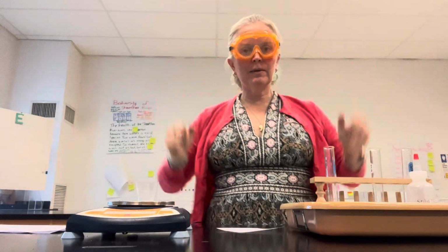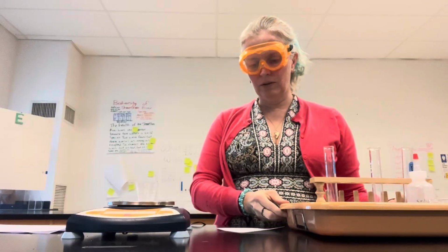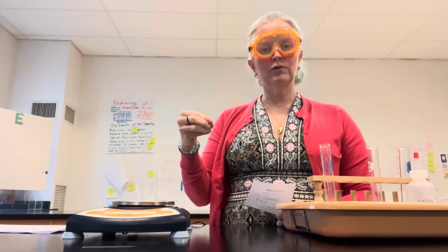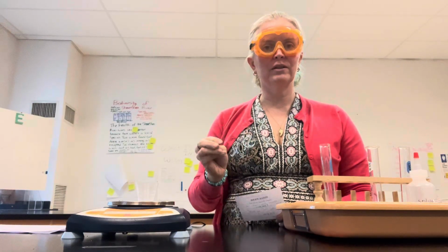Hi again. This time I'm going to demonstrate the procedures that we'll use in the mixtures laboratory, which is called the Chromatography Lab. I say the mixtures laboratory because in this unit we're studying mixtures and different components of mixtures, and chromatography is one way to separate the components of a mixture.